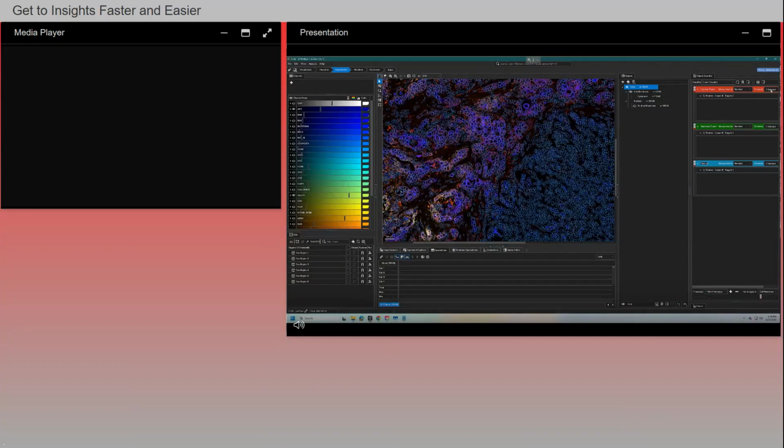And I'm going to use different input here. For this one, the input will be GLUT1. This one will be A1 and GLUT1. And the last one will be PKM2. Now, you, as the subject matter expert of your sample, you'll know which channels to use to distinguish.